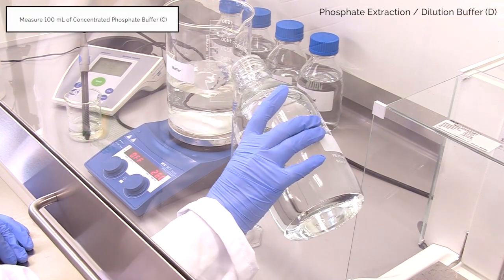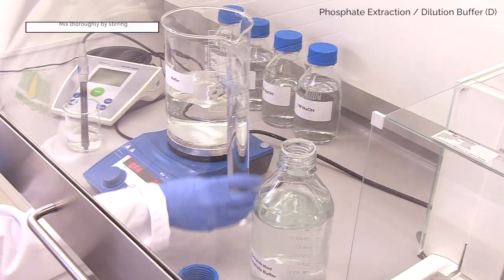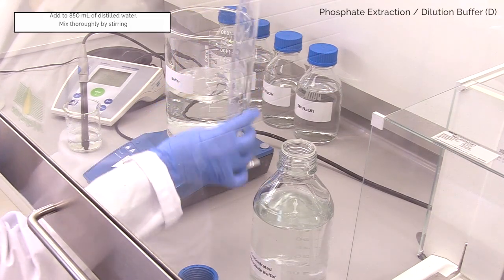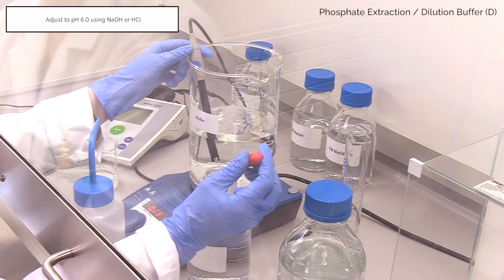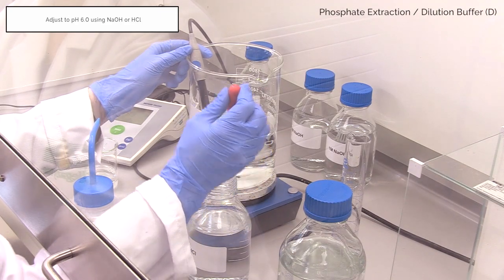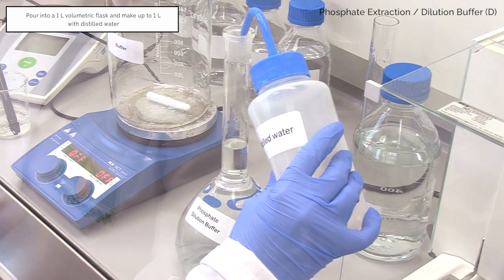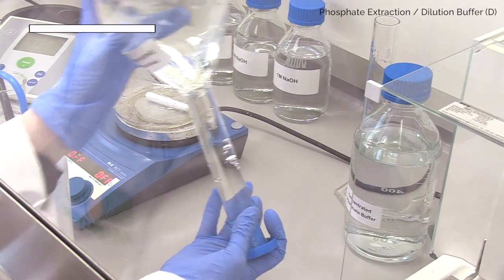Add 100 millilitres of concentrated phosphate buffer to 850 millilitres of distilled water in a stirring beaker. Check pH and adjust if required using 1 molar NaOH or 1 molar HCl to pH 6. Pour into a 1 litre volumetric flask and make up to 1 litre with distilled water. Invert to dissolve.